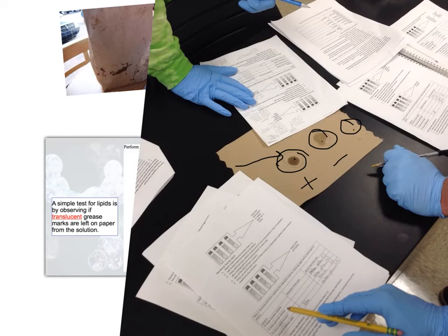Okay, so remember, you're going to be getting at least 9 test tubes. Okay, you're going to have a positive and a negative control for each test that you do. And then you're going to have at least one unknown sample. And this is going to be a sample of the food that you brought in. So it could be one person's food choice or 2 people's food choice, depends on what you want to do. And you're going to follow the directions in your lab manual and what I've described in the couple of videos here to perform those tests.